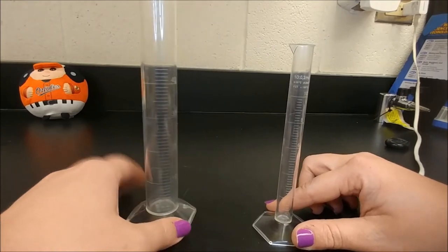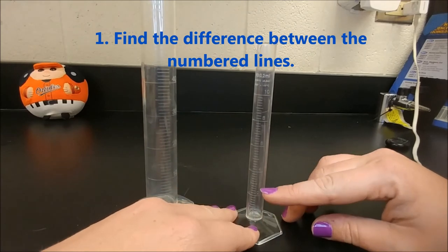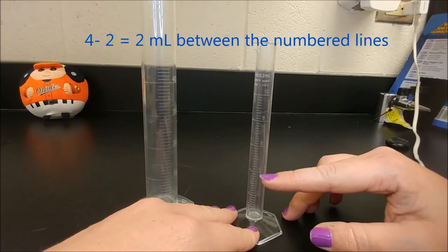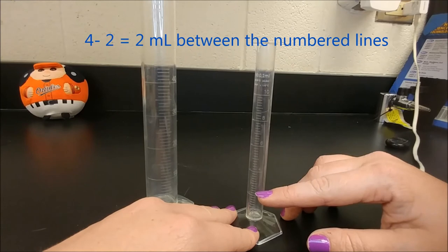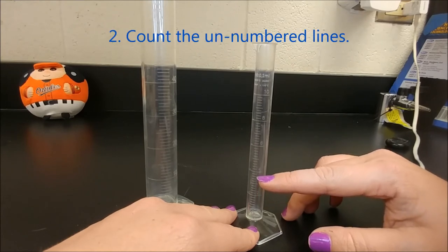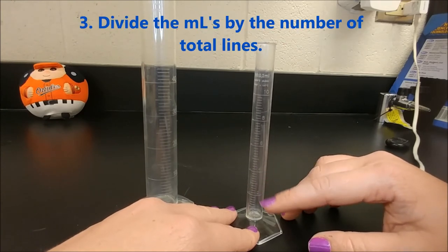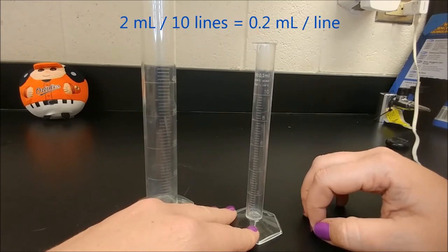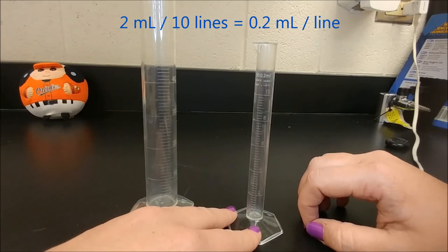But we have to figure out what the lines are worth. This lower line is marked two and this one is marked four, so there's a difference of two milliliters in this space. The next step is to count the lines again: one, two, three, four, five, six, seven, eight, nine, ten. Ten lines for two milliliters. So we put the two milliliters on top divided by 10 lines — each line is worth 0.2 milliliters.